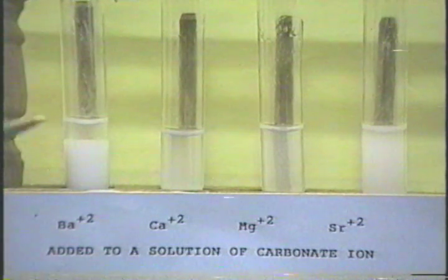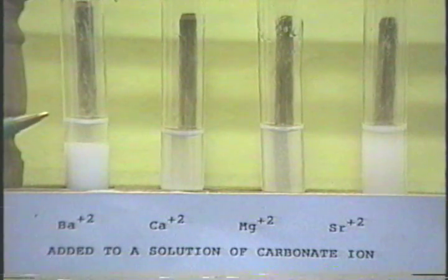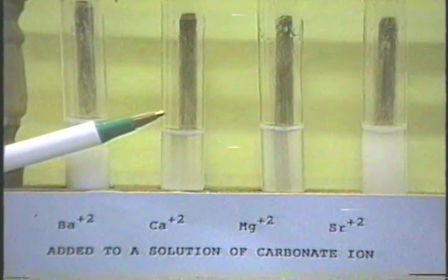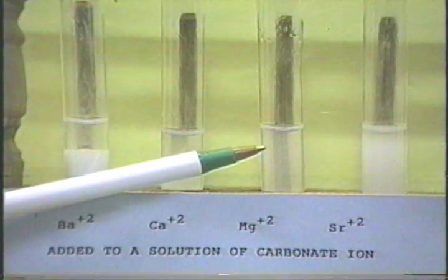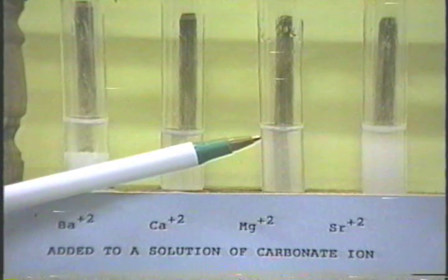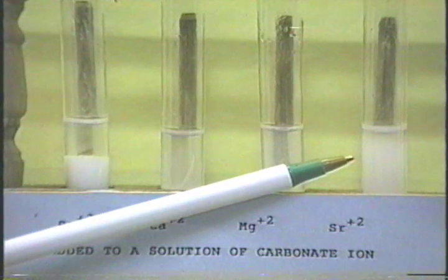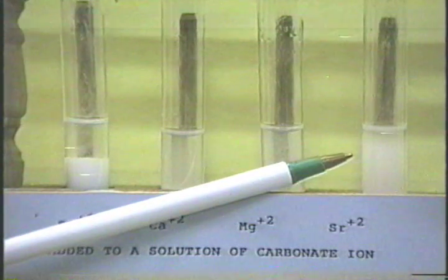Now, the barium carbonate, I'd say that's a lot of white, finely divided precipitate. Calcium carbonate, about a medium amount of white flocculent precipitate. The magnesium carbonate, very little white flocculent precipitate. And the strontium carbonate, well, that's a lot. It's white and it's finely divided to flocculent precipitate.